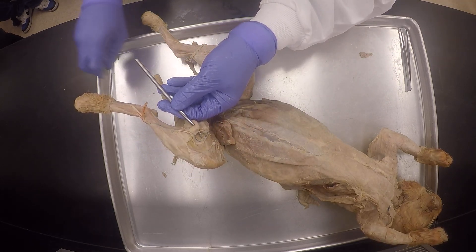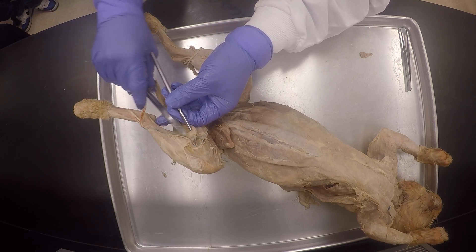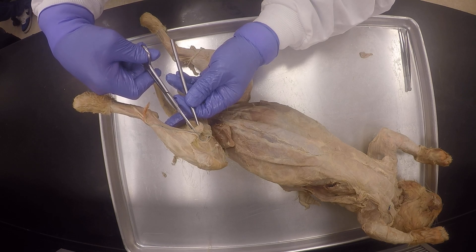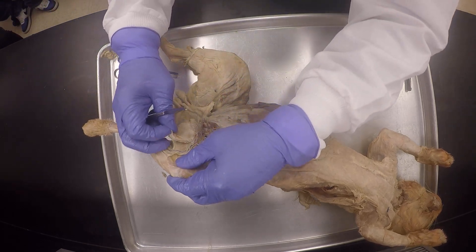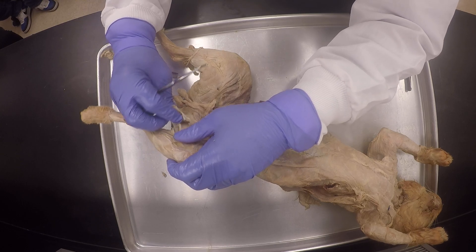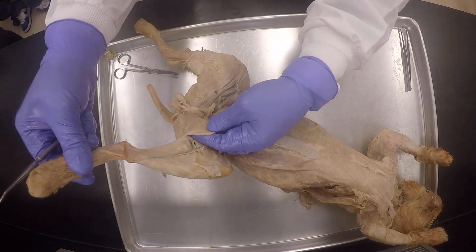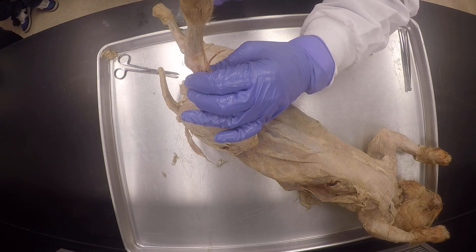It's slippery now because it's all greasy. Okay, very good. So with the gracilis, I'm going to peel it off here from the top. Do you see the line here? And it's separating.